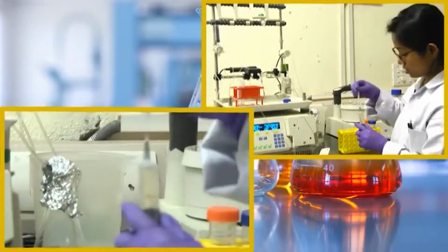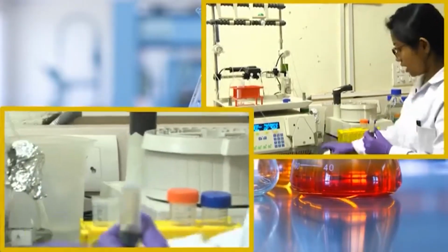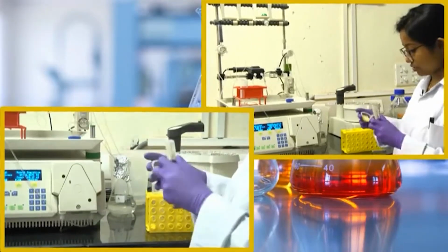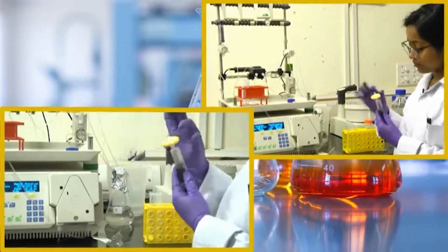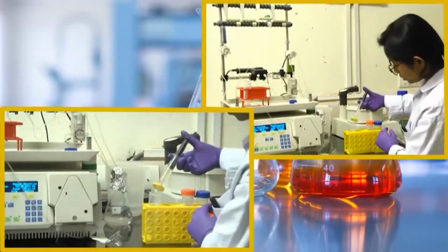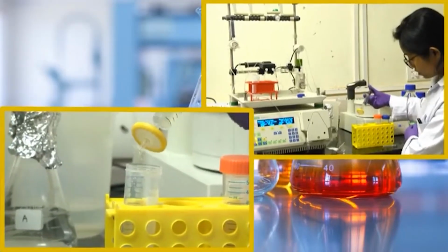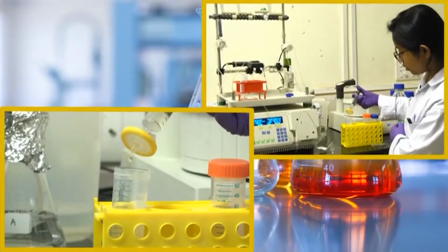I will remove this needle, and this is a 0.22 micron syringe filter. So, you can attach this filter to this particular syringe like this. This has a filter membrane, and in a clean tube you just take that supernatant. Basically it will filter out any kind of particulate matter that is beyond 0.22 micron. So, this will ensure a longer storage or a longer lifetime for your column.